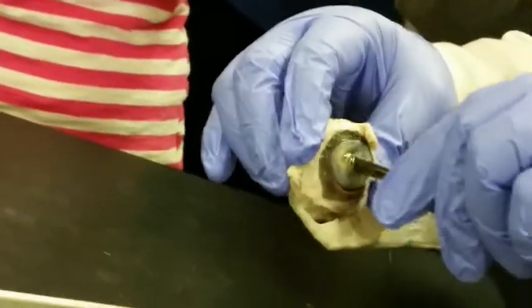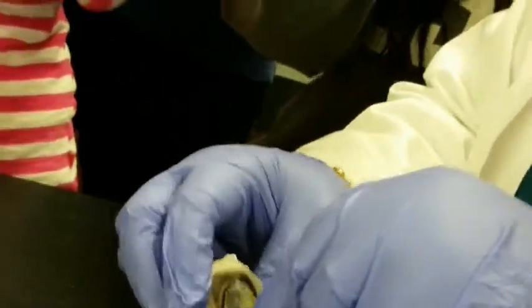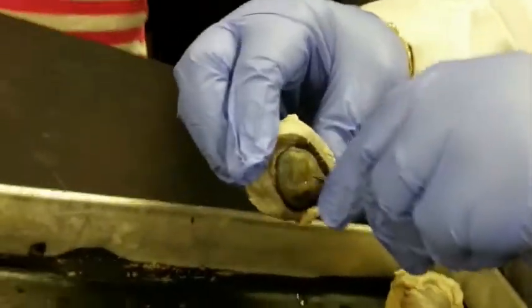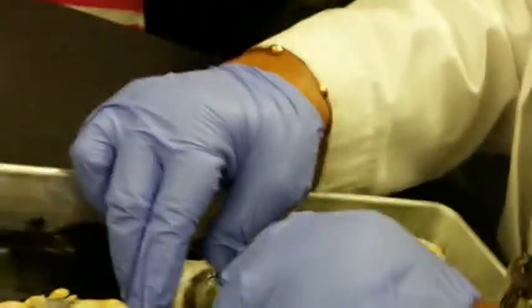What is it called? Aqueous humor. So you should be telling me now. Yeah, that's the aqueous humor. Sorry, I can't test you on the aqueous humor because it's actually watery fluid. So that's the aqueous humor that is popping out.